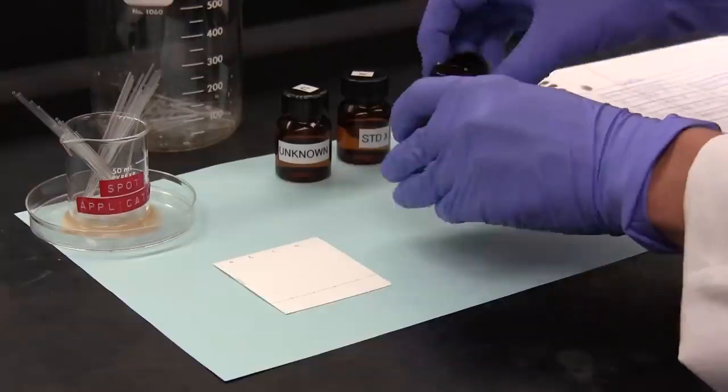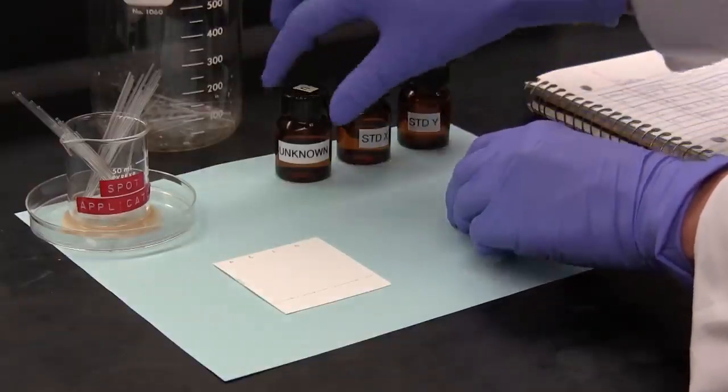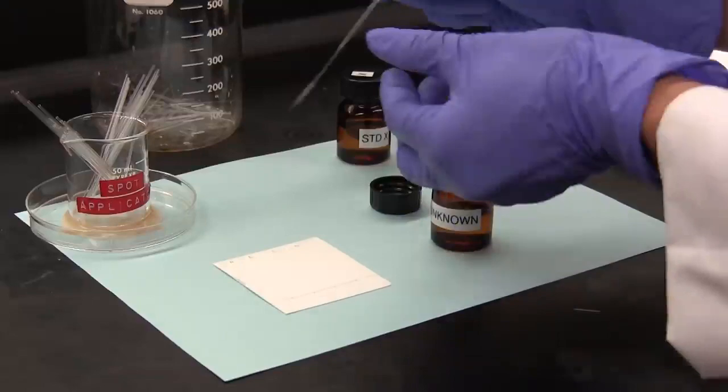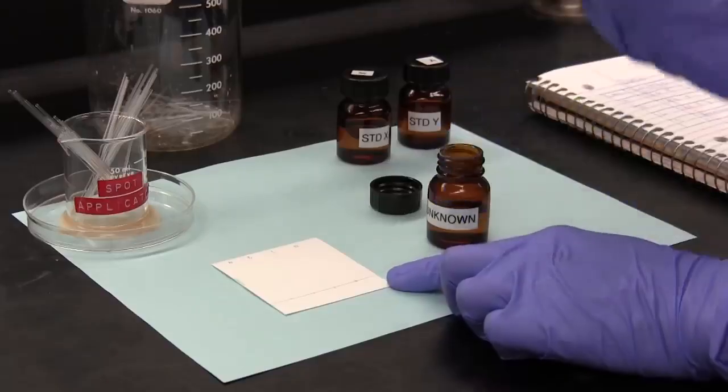And note how we use a clean capillary applicator with each solution. This is to avoid cross-contamination between the lanes. And so with a clean capillary applicator, we apply a spot of the unknown in lane D.